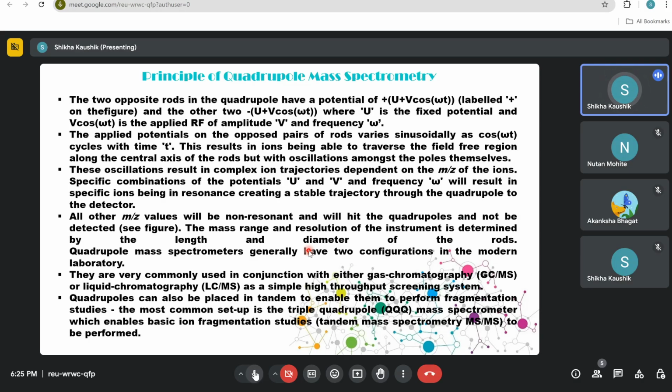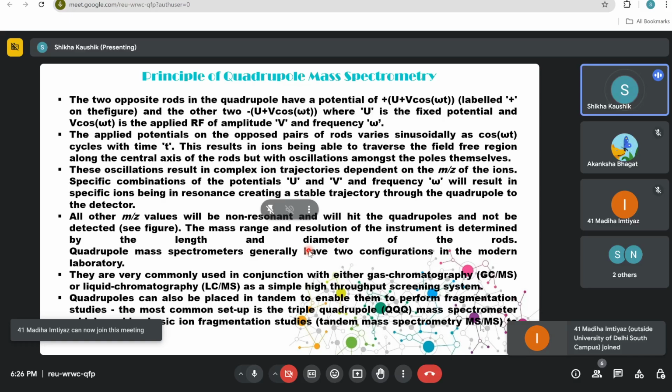But when you're doing discovery proteomics, where you have no prior information, whatever samples you are preparing, you will always have some dilemma whether things went wrong during sample preparation, or this is what I'm getting from my sample. Because when it comes to clinical samples, you have to be a little more careful, because you may not get those samples again, right?